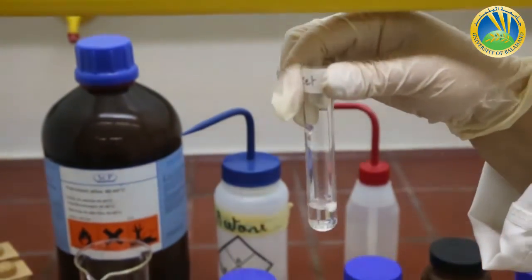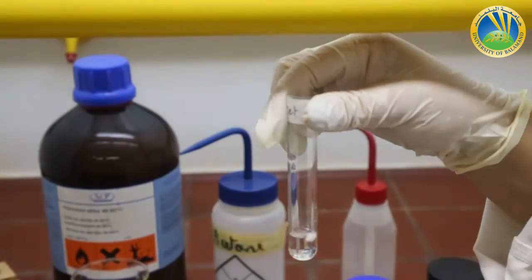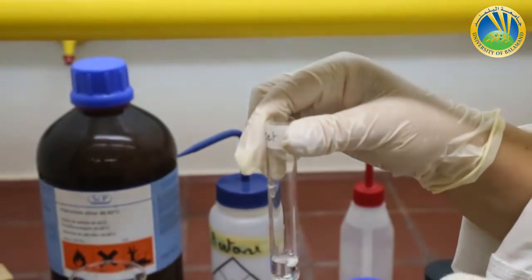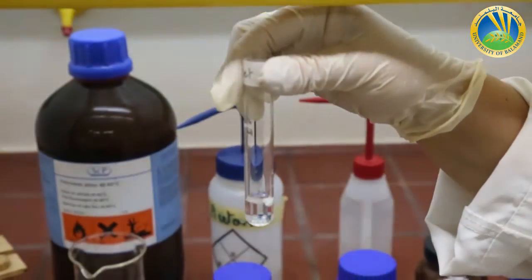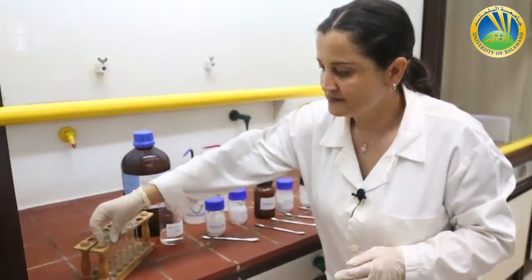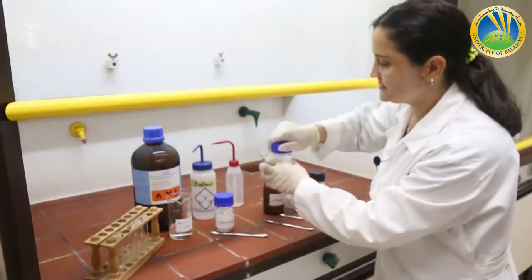Now I have to put this test tube inside a water bath having the same temperature as the boiling point of the solvent. This time it's water, so the water bath is at 100 degrees C. Now I have prepared acetanilide. I will do the same for benzoic acid.